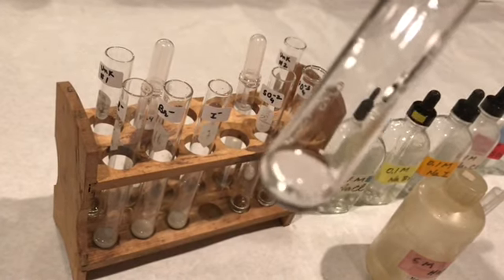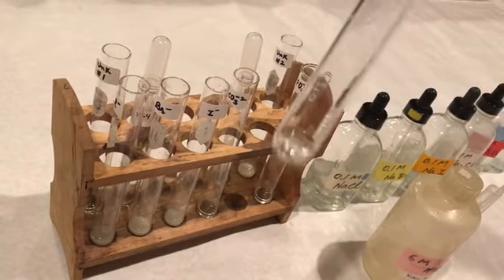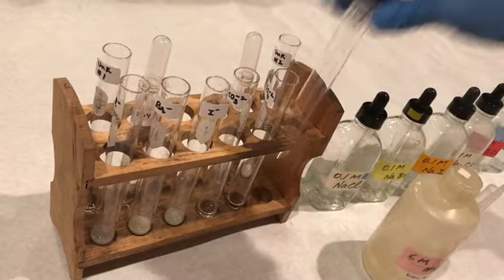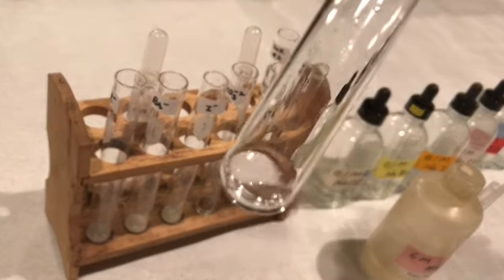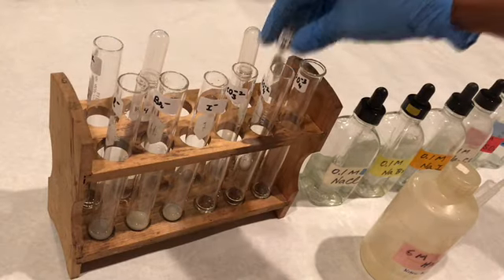See if there is any change after adding the nitric acid. Sulfate, phosphate, unknown number 1, and here is the unknown number 2.